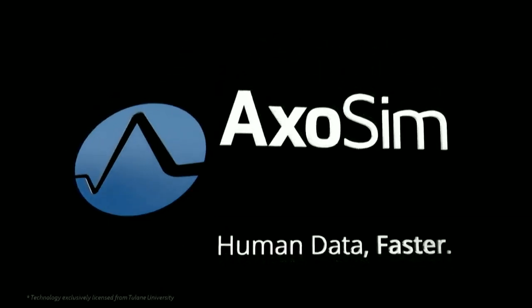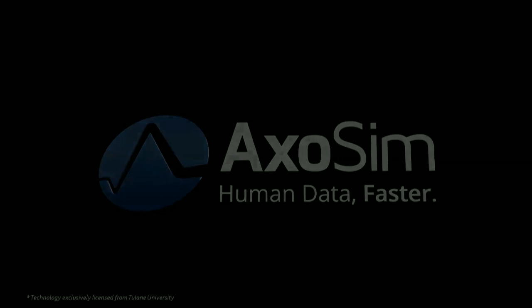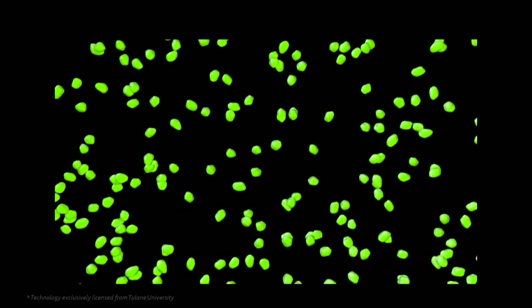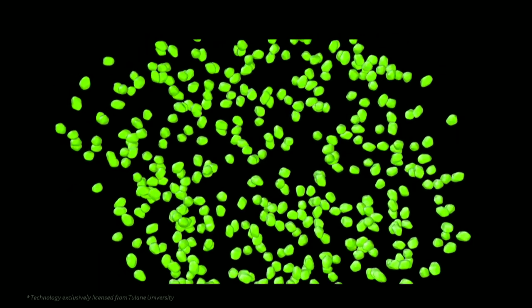Briefly, what that looks like. We can take different cell populations. I mentioned, of course, neurons or sensory neurons with Schwann cells. We can do motor neurons and astrocytes. It depends really on the application. We then take those co-cultures together and put them into a spheroid.